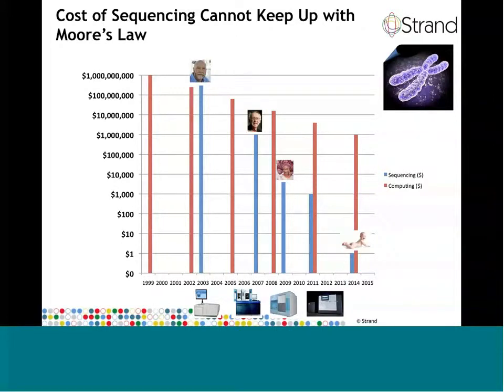No life science researcher just sequences a complete human genome of 100 individuals for the fun of it, but they have real scientific questions that they want to get answers to. Questions such as, what's the molecular cause of prostate cancer, or can we predict which individual has the propensity to develop a melanoma?